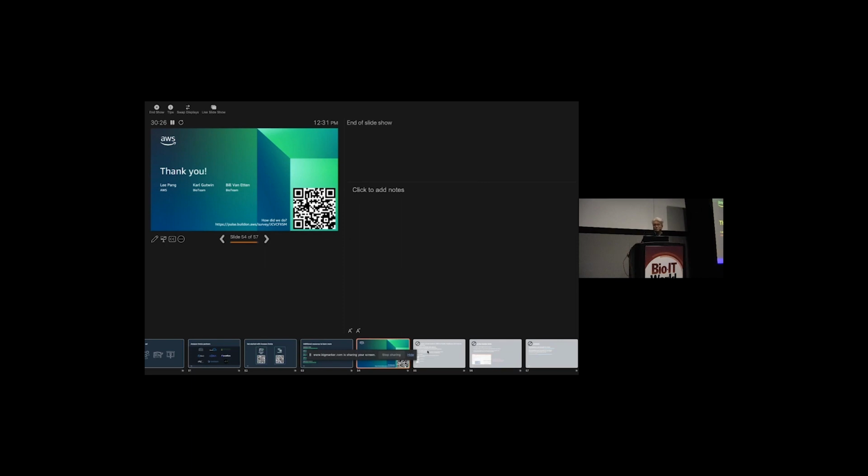Go ahead. Is there a way for your workflow to depend on custom libraries? What if I want to use, for instance, VEP? Is there a way to handle that? That's an it depends. I think we'll need to talk in a little more detail. You can use the VEP tooling itself and then talk to a predefined cache.